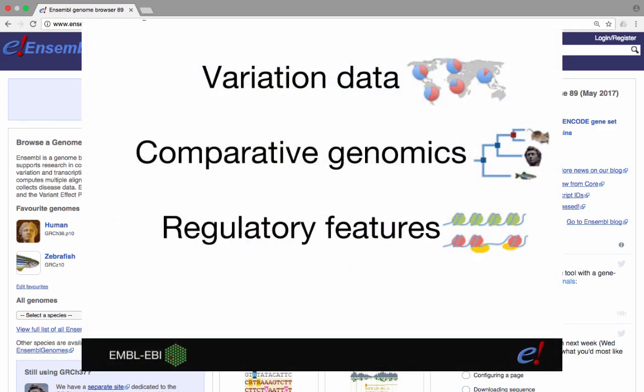Then, in addition to the gene annotation, a variety of other data types are further annotated onto the genome where available, including variation data, comparative genomics analyses, and the annotation of regulatory features.